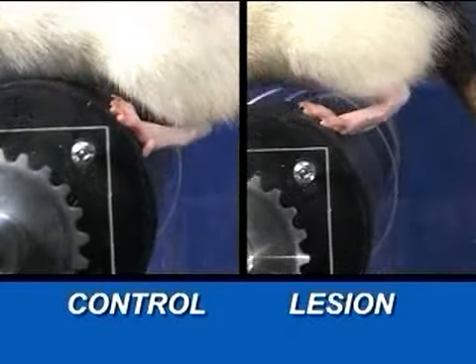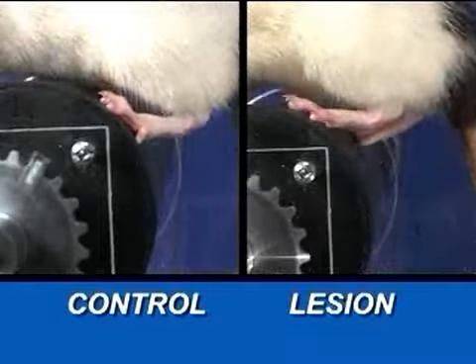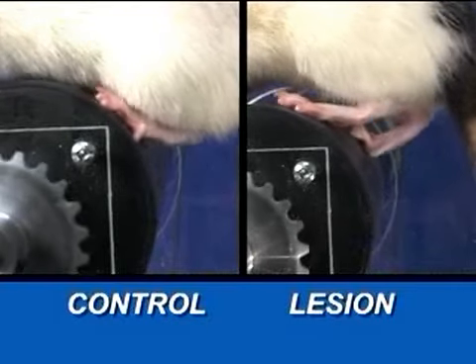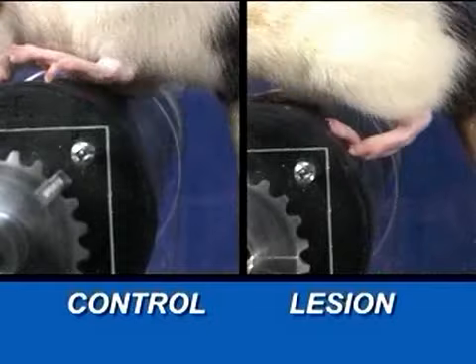As the control animal's hind limb pushes off the rotorod surface, the paw rotates to the outside. There is a corresponding rise in the backside of the rat as the leg extends. There is little to no rise during the same phase of the 6-OHDA animal's step.